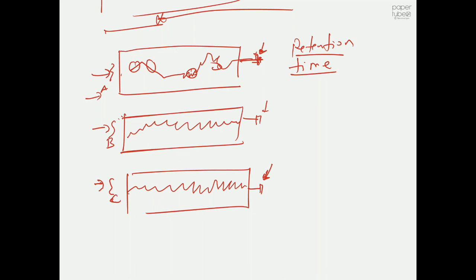And even this one single molecule that we are dealing with at the moment will go through a sequence of adsorption and desorption stages: one on the first particle, second particle, third particle, and so on. So keep these things in mind. That's how retention time works. Obviously, in the real world, nobody is going to work with one single molecule. One single molecule in a solution is what we would call infinite dilution; we cannot dilute more than that. But obviously, we will deal with at least 10 to the power of 23 molecules, that's nothing but your Avogadro number. I think this is okay so far. Not so bad, I think, until now.